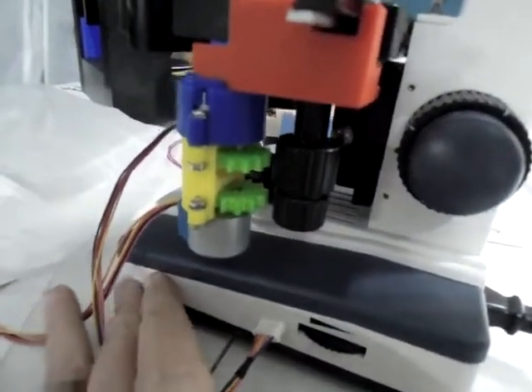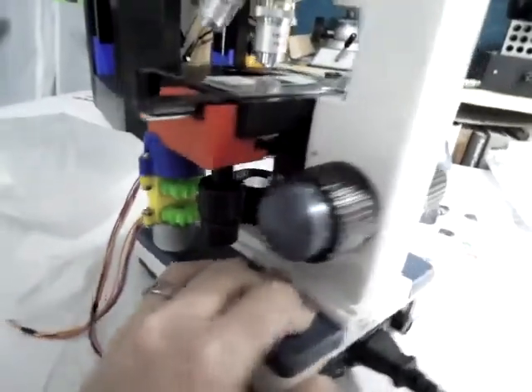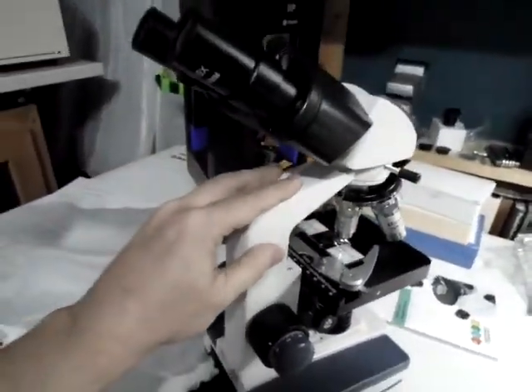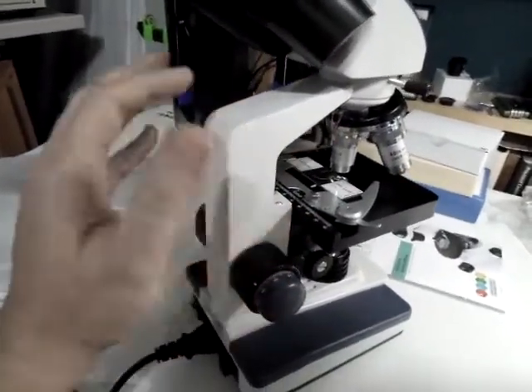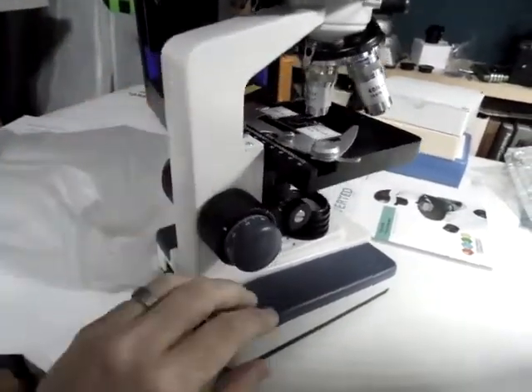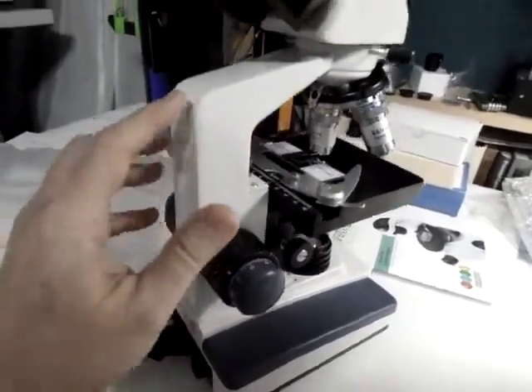I'm going to have to print out a bunch of failed prints today probably to get it going. The second one I'm interested in — this scope with extra eyepieces is $200 American, so very affordable, good quality, it's all steel. Made in China, of course, but it really cuts the cost down.